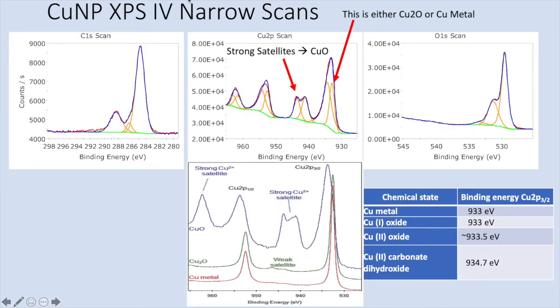These are the narrow scans. We already did the carbon 1S, which we used to shift the entire spectrum. I couldn't fit this with a purely single set of spectra or doublets. It has a large satellite, and I needed an extra peak here to fit this first peak — Cu2P 3/2. So the question is: is it Cu2O or Cu metal?